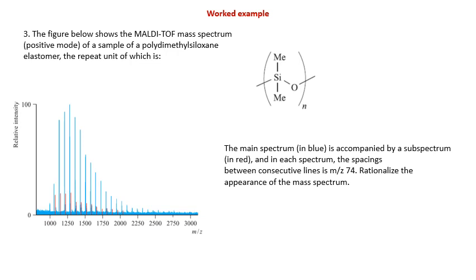So this kind of peak signals are basically coming from polymer chains of different chain length. With increasing and decreasing numbers of this monomeric Me2SiO unit, the signals vary. Similarly for the set of red peaks.